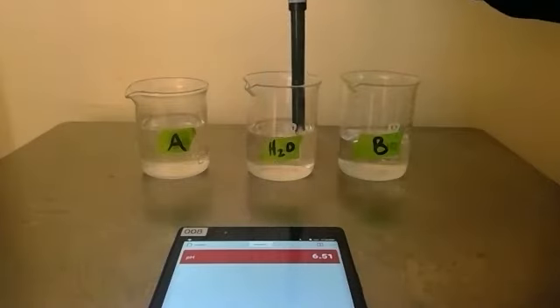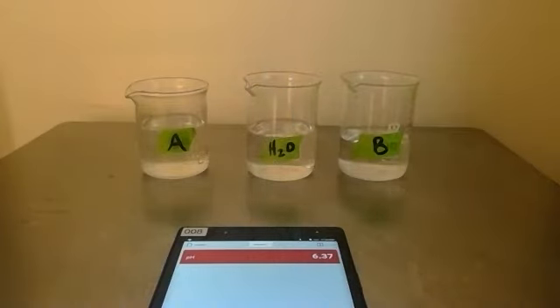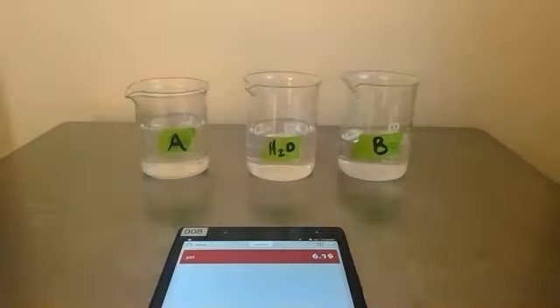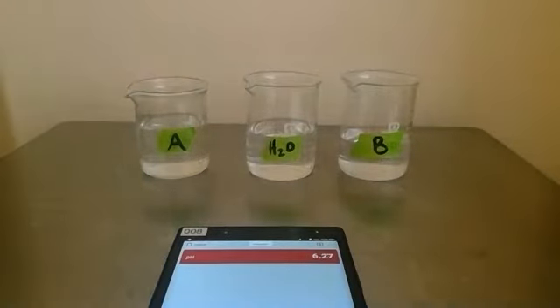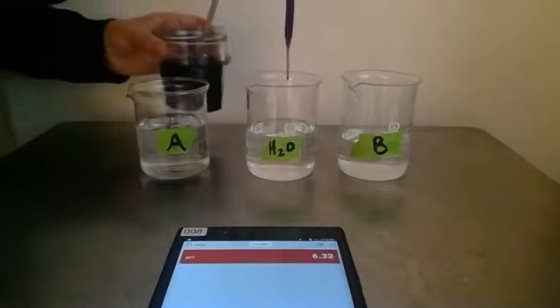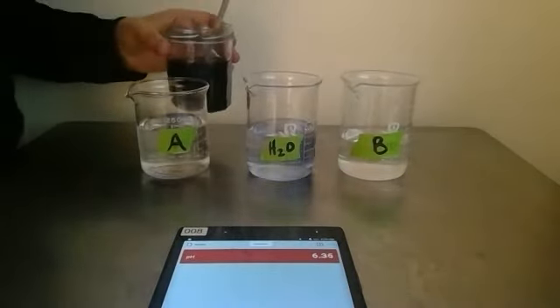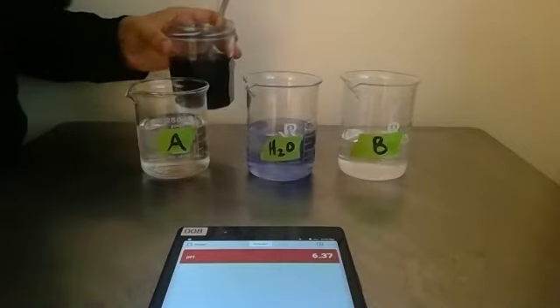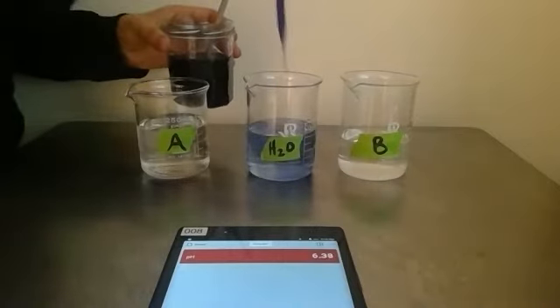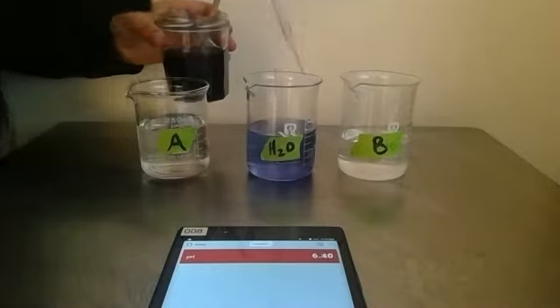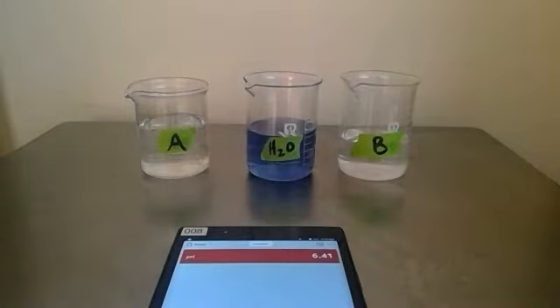Now I'm going to remove this, set it aside, and show you the color that this forms when we add our indicator dye. Our indicator is kind of a bluish purple color. I'm going to add it to water and we're going to see that it creates a blue color, maybe with a hint of purple to it depending on how well your eyes can see different types of color.